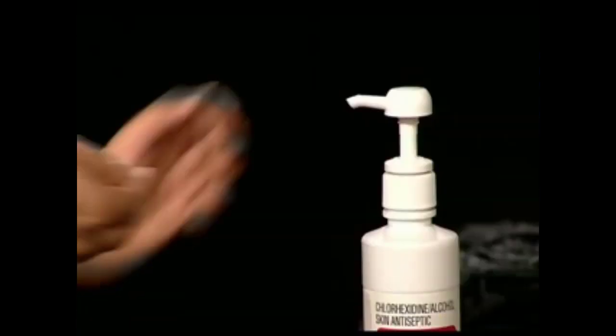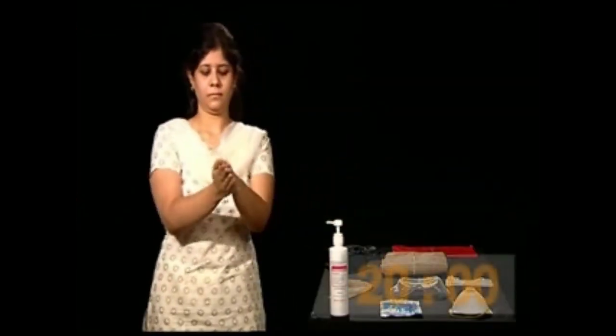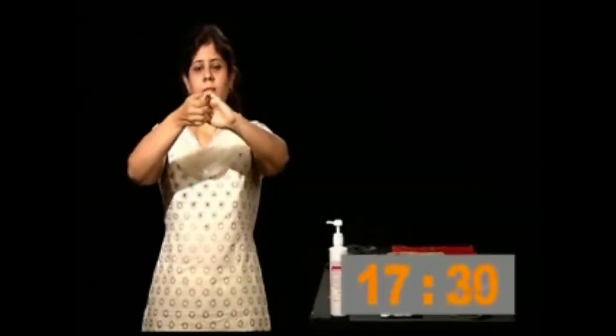When using microbial hand sanitizer, apply liberal quantity on your hands. Rub vigorously for at least 20 seconds, making sure that no part is left out.